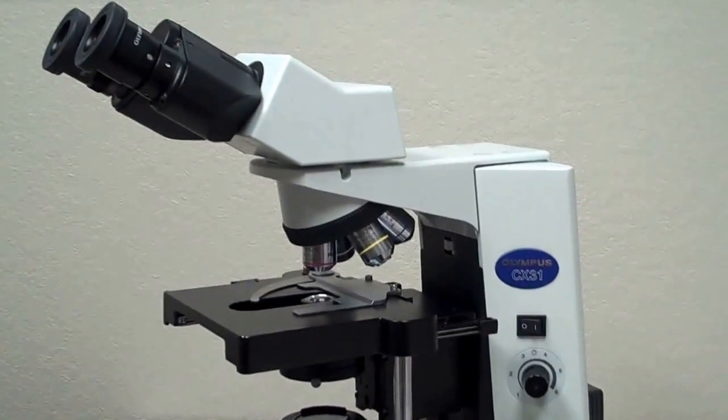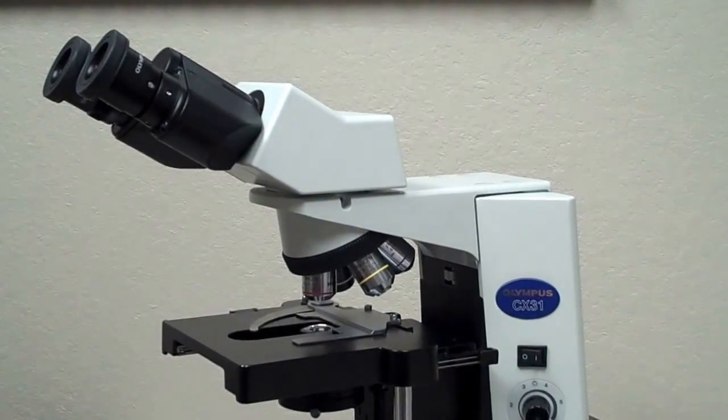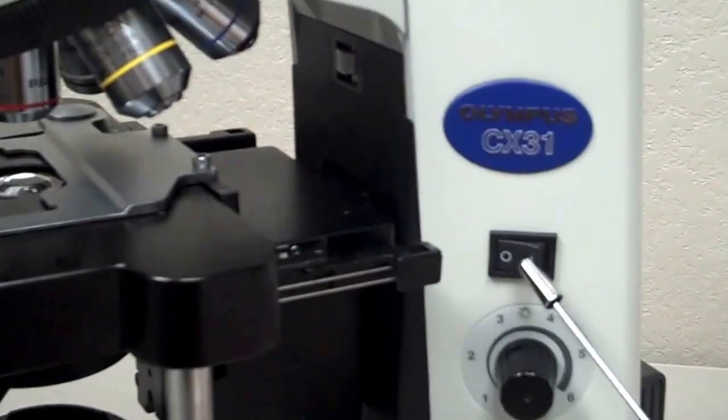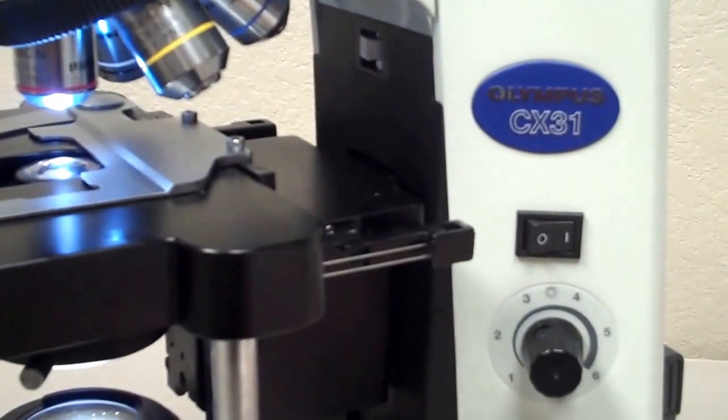I'm going to begin with the power switch. As you face the microscope, the power switch is on the right hand side and it's a simple rocker switch. You basically just rock the switch on to turn the microscope on.